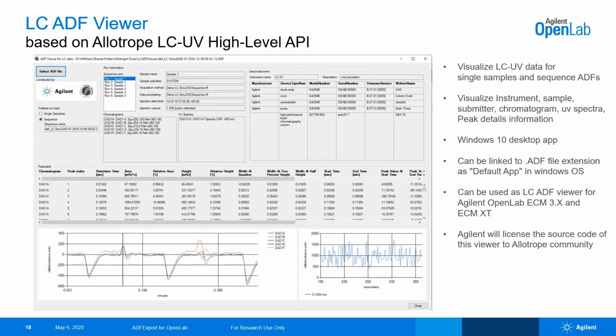It's not yet visualized, but we can easily add this. As I said, we will give this code to the community, and this can be further extended. So it's easy to add this as well. But that's not yet in that version, but it shouldn't be a big thing to visualize that. Okay, thank you. This was my question.